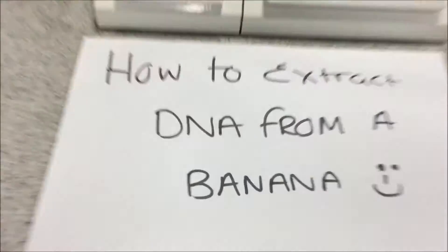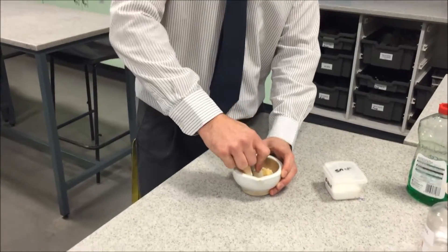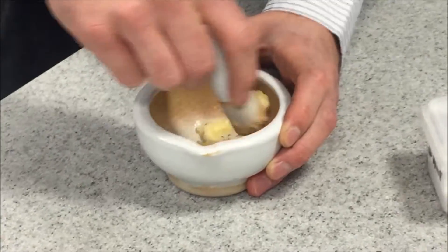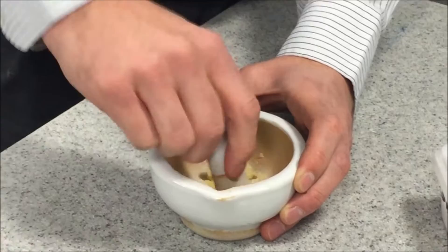DNA from a banana. First of all, have some banana and break it up in a pestle and mortar. This will help to get some of the cell walls broken down and start to open up the cells so that we can extract the DNA.